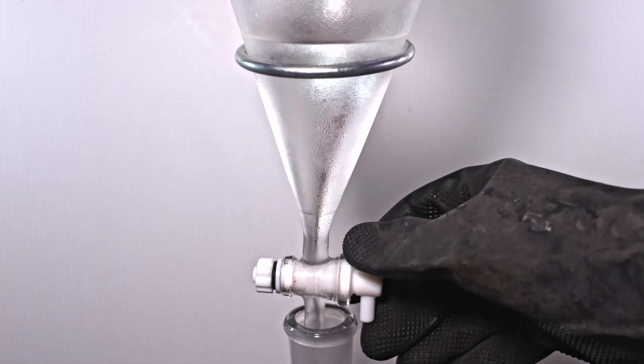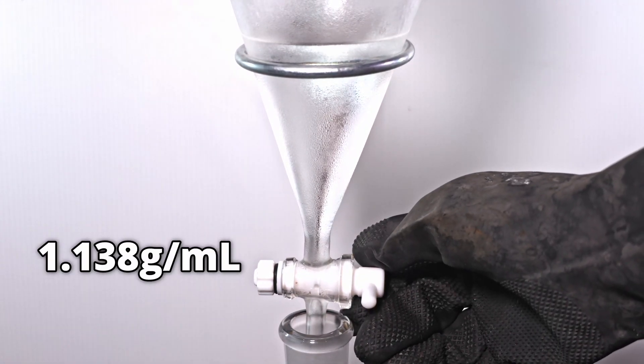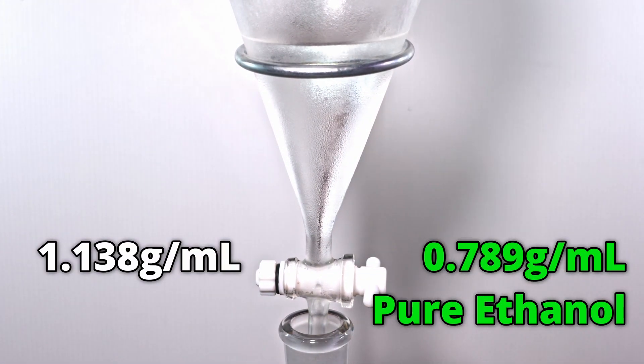However, the top layer actually has a density of 1.138, meaning there's still a decent amount of ethyl bromide in there.